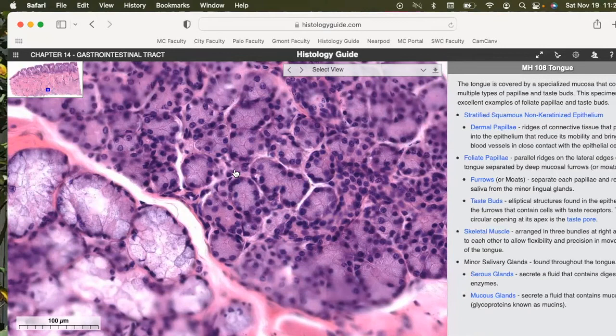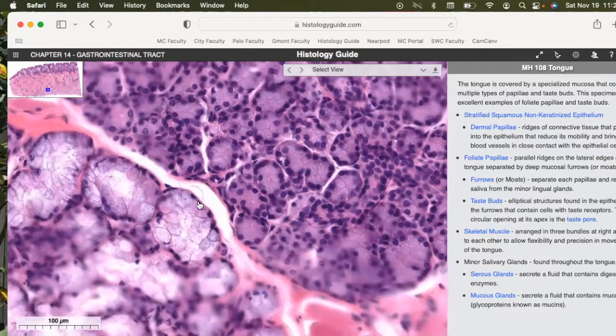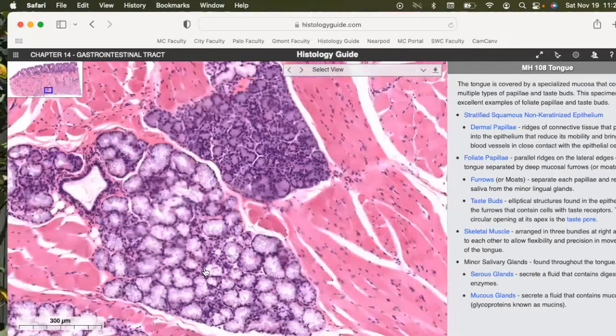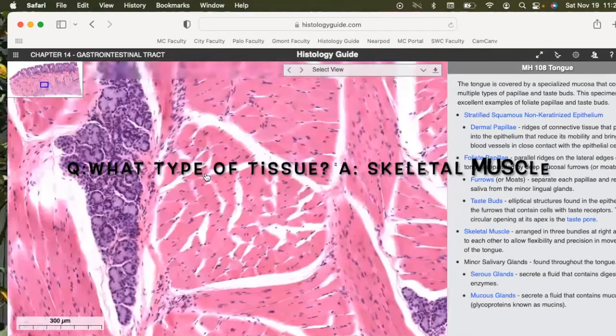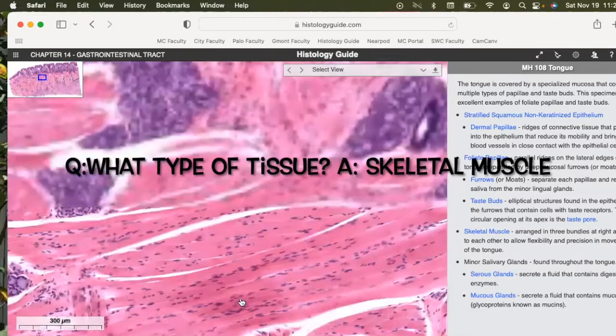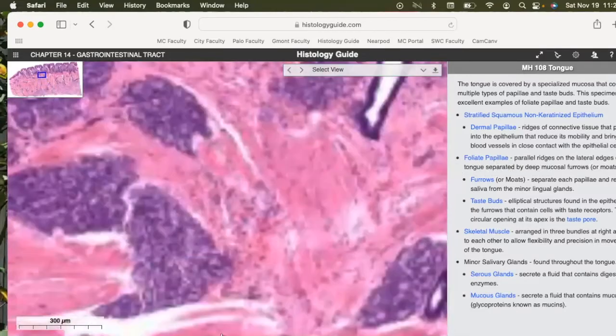And they might be separate, they might be mixed, but I'd show them like this so you could tell them apart between the two. Just remember which one is which. All this is skeletal muscle, all the different kind of angles going through it. It's pretty complicated. And we're going to move up toward the surface.